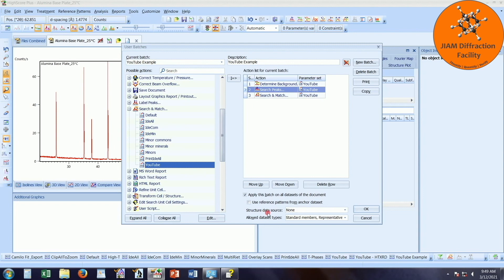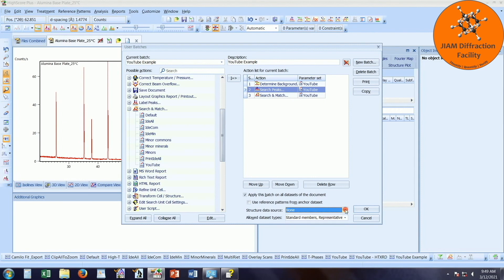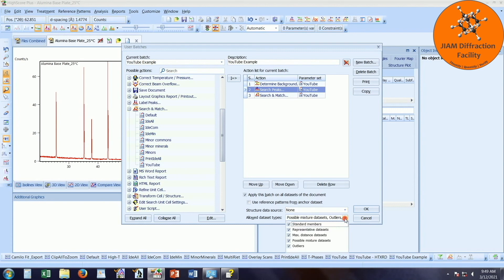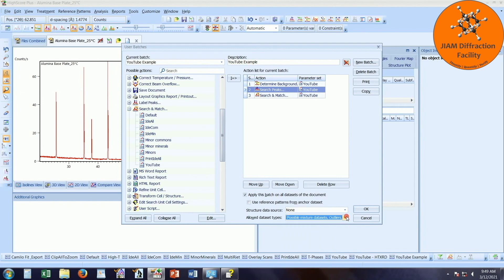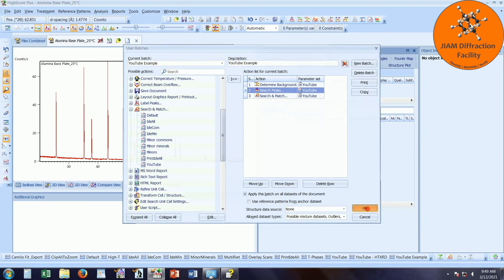For this example, structured data source doesn't really matter. This is more for if you are refining your data. So for this, I'm just going to leave it at none. And allow data set types, I don't really change this. I allow any data set types. So all of them are checked. Once all of that is set, you just click OK. At that point, the button appears for your new batch process.